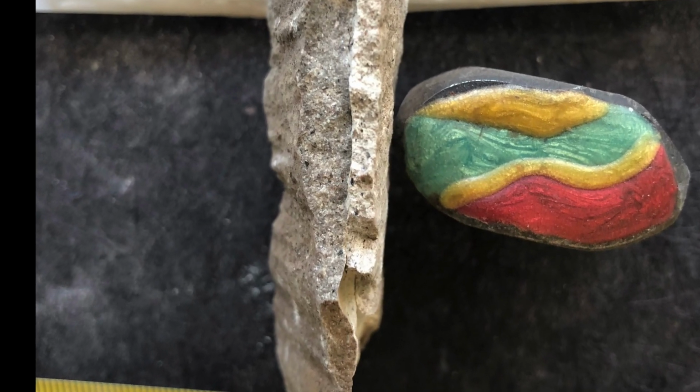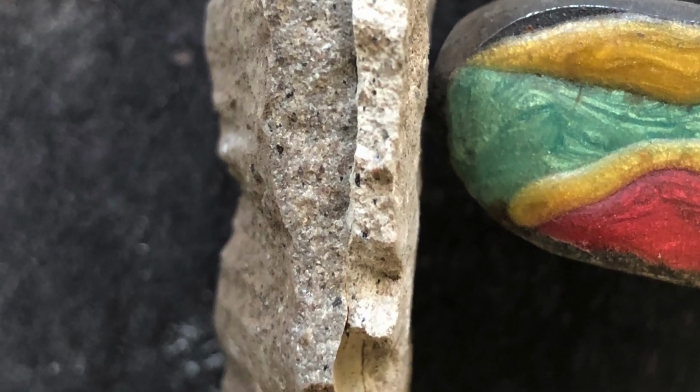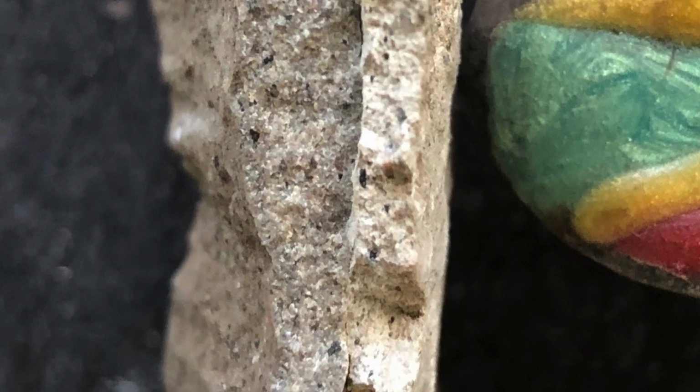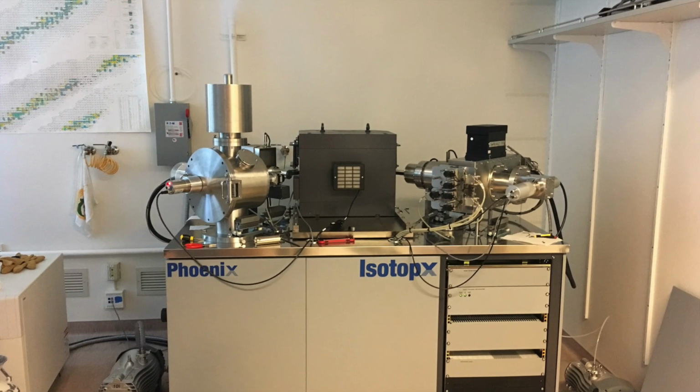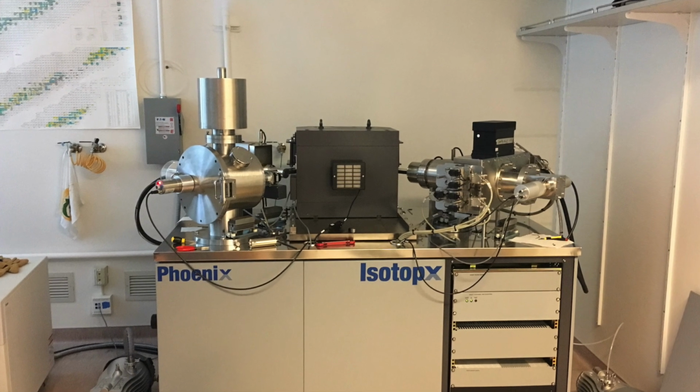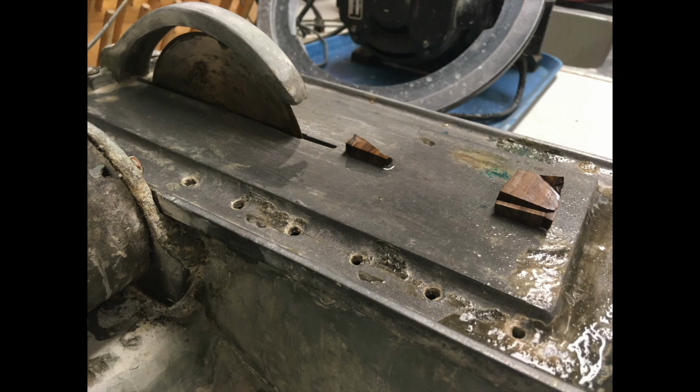These two layers motivate a key hypothesis, that both layers record two distinct time frames of carbonate precipitation. We will test this hypothesis later on with uranium-thorium geochronology using measured uranium and thorium isotopes. But first, we will subsample multiple layers of B176. To do this, we will isolate a thin column of the sample by cutting it out with a rock saw.